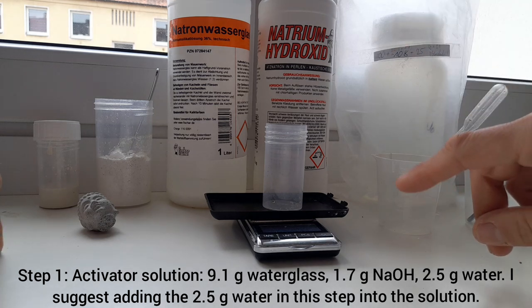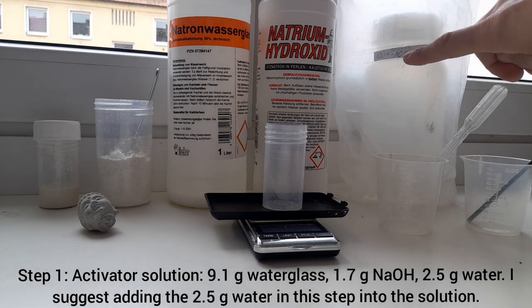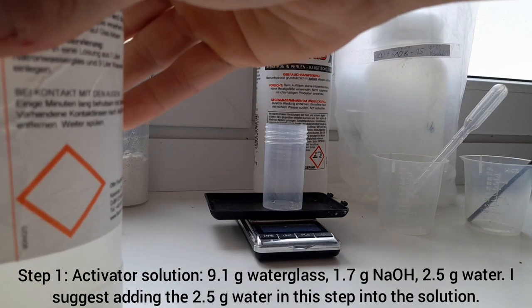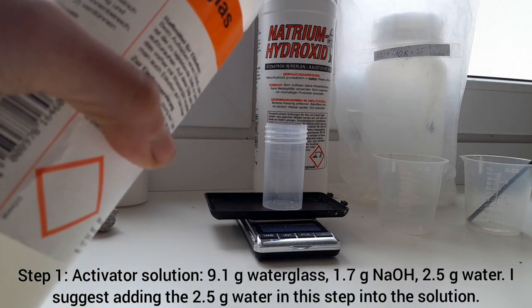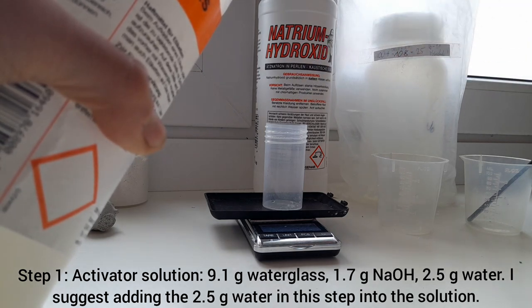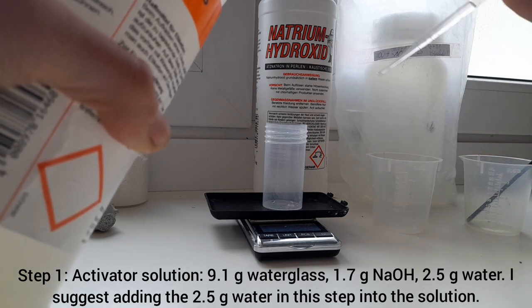I want to show you how we make the activator or hardener solution. Looking at the recipe, for this small batch we only need 9.1 grams of sodium water glass solution. Let's switch on the scale — 9.1 grams.